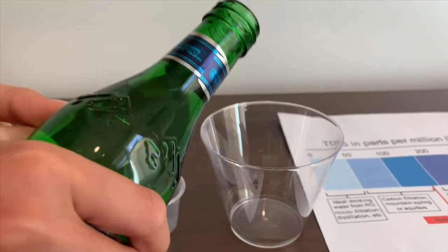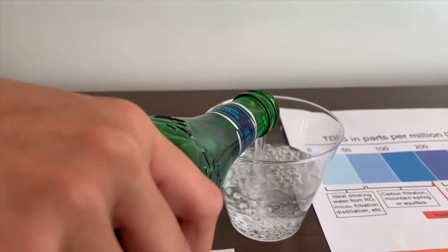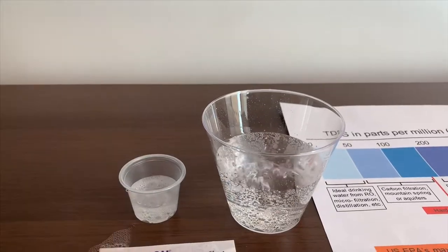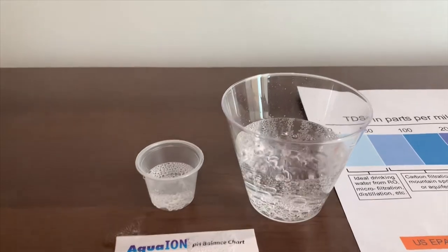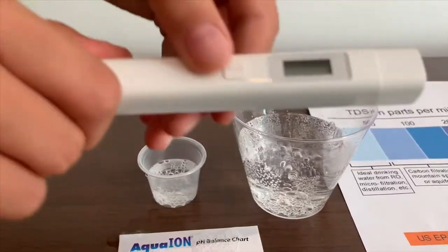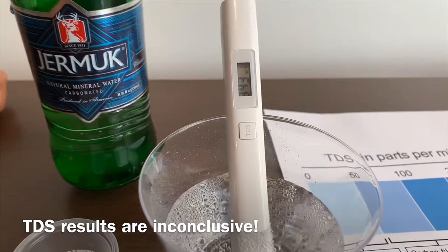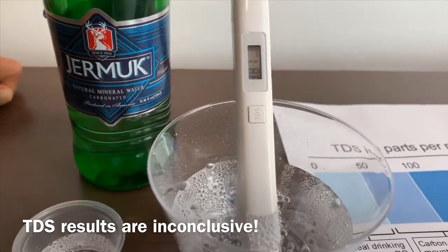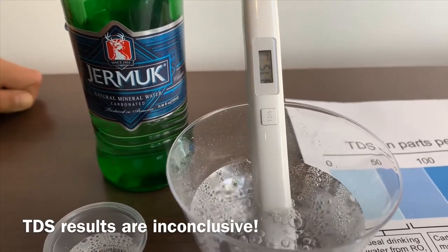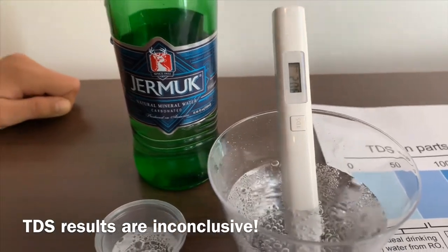Let's pour some water in. Turn the meter to TDS and make sure it says zero. Put it in and let's wait. It's about average tap water.